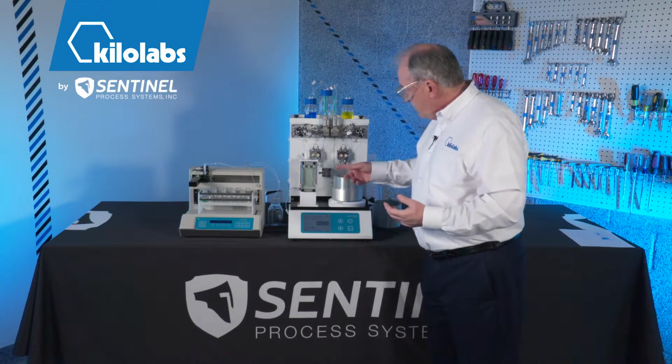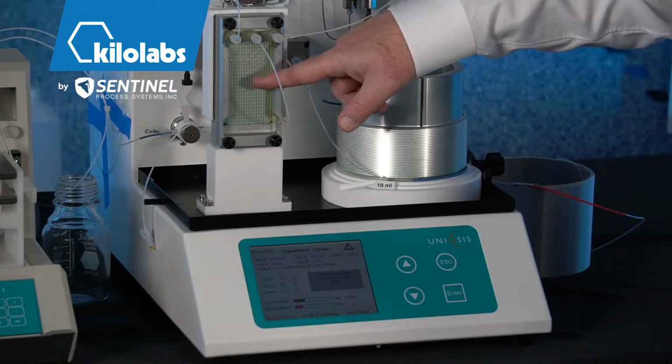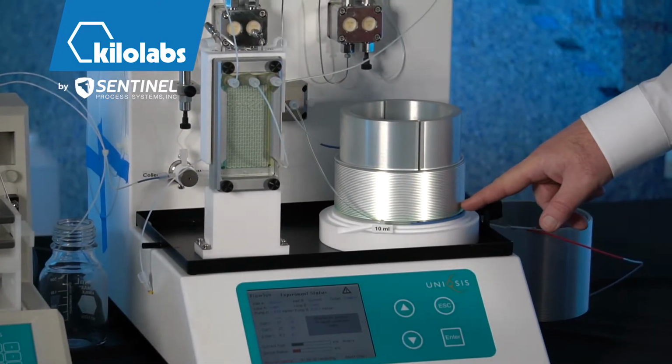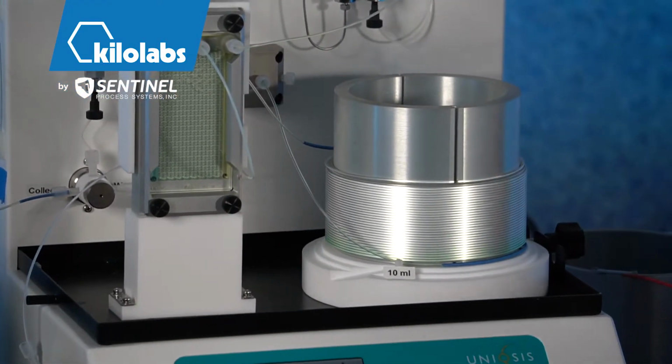Now I just heard the clicks, and you can see the green is starting to show up strongly in the mixing chip. Now it's coming out of the mixing chip and into the coil, and you can see the green starting to advance in the coil just like we did before.